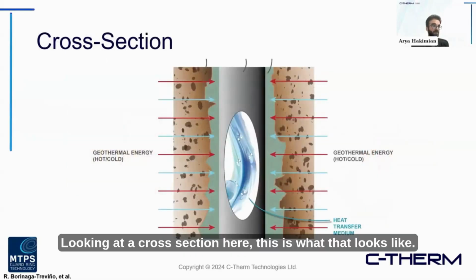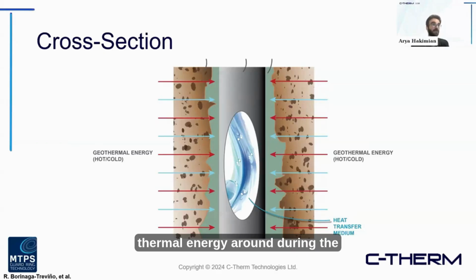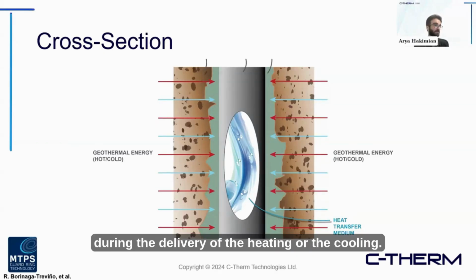Looking at a cross section here, this is what that looks like. Again, that heat transfer medium is what's going to be moving that thermal energy around during the delivery of the heating or the cooling.